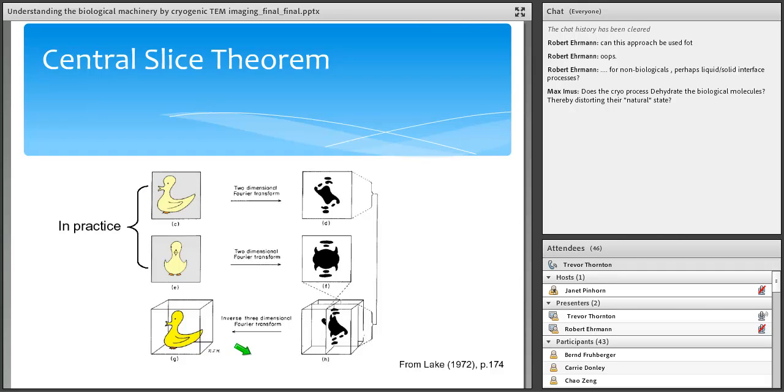And so in an electron microscope, unlike crystallography, we can reform the image. And so we will get an image formed at the imaging plane, whereas you can't, well, they do now. They have Fresnel lenses, but they're not very effective. But you can't reform an image very easily from X-rays. So it's interesting, isn't it?